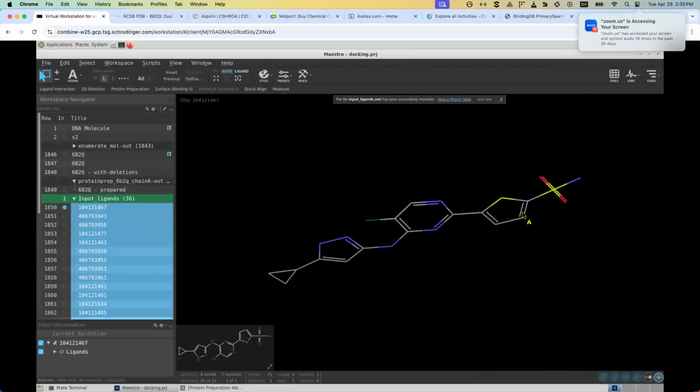If you have done this, tell me what the issues are with these molecules. If you're having difficulty finding the files, please let me know. If you have the molecules loaded, please tell me what is wrong with the molecules. If you haven't loaded the file yet and need help with that, please let me know.